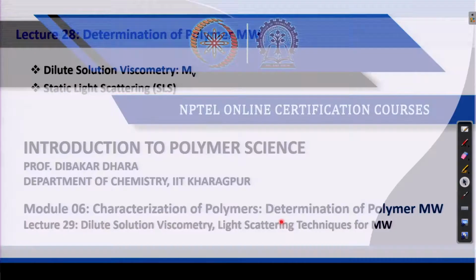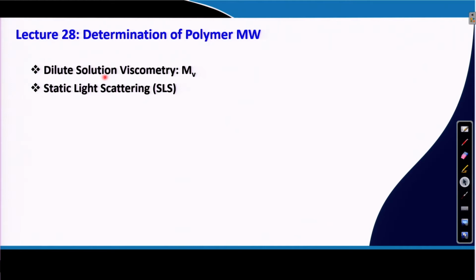Welcome back. We will continue our discussion on determination of polymer molecular weight, and in this lecture I will talk about dilute solution viscometry, which is utilized to determine viscosity average molecular weight, and I will talk about static light scattering.